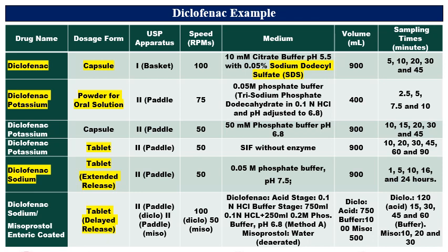This information is taken from the OGD, that is FDA information for dissolution. So diclofenac is available in capsule formulation. It is available in diclofenac potassium form, diclofenac sodium form, and it is also available with the other drug, that is misoprostol. Here the formulation design is delayed release.